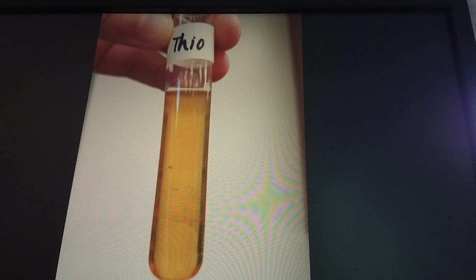The thioglycolate test was a test for the type of growth of our unknown. It determines the oxygen requirements of a bacterium. The broth contains sodium thioglycolate, thioglycolic acid, L-cysteine, methylene blue, and 0.05% agar. Since our results showed growth at the top of the test tube and throughout the test tube, just not at the bottom, it could be said that oxygen was not required, but it did not stop growth from occurring when present. Therefore, we said that our unknown was a facultative anaerobe, and E. coli is indeed a facultative anaerobe.